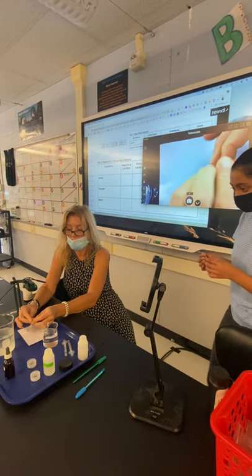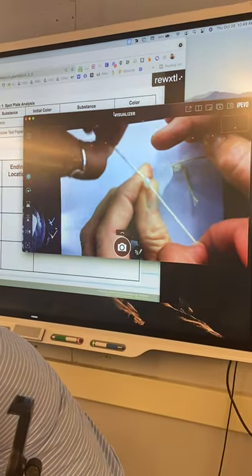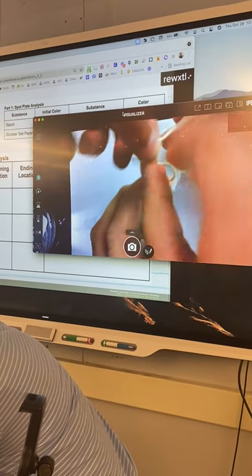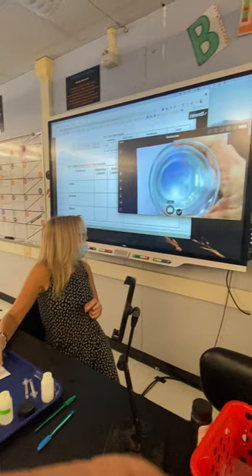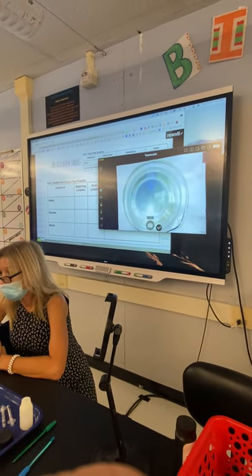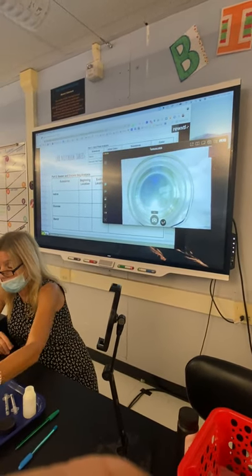We're going to tie off this end. She's going to go rinse this off so there's nothing on the outside. Here is my beaker of water — what needs to go in my beaker of water? Look at your lab. What goes inside the beaker of water? IKI — that's iodine. So I'm going to put some iodine in here.